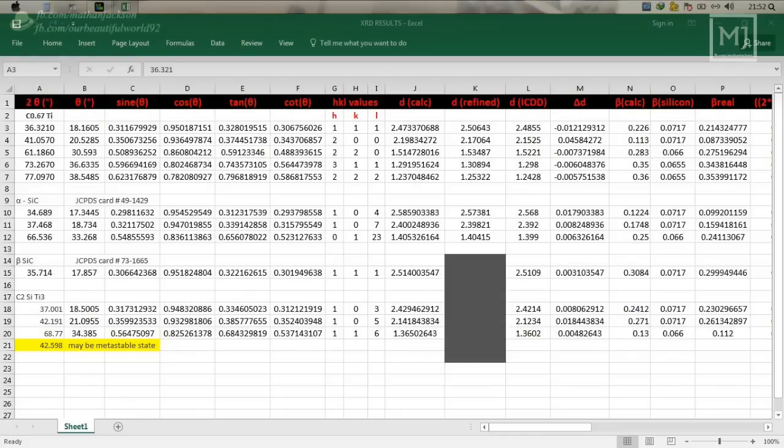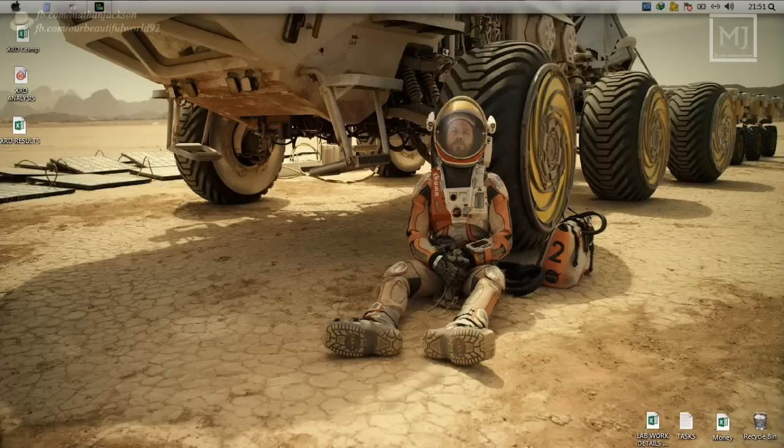Here I made this Origin template based on my senior's template who did the same analysis in Microsoft Excel. Instead of doing plotting part in Origin and calculation part in Excel, I make this template to do both plotting and calculation in same Origin itself. Let's get into the template.